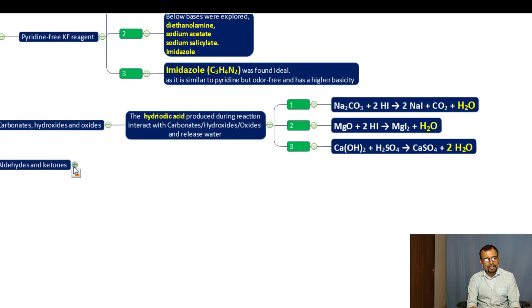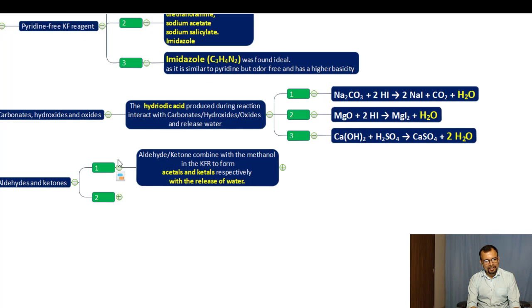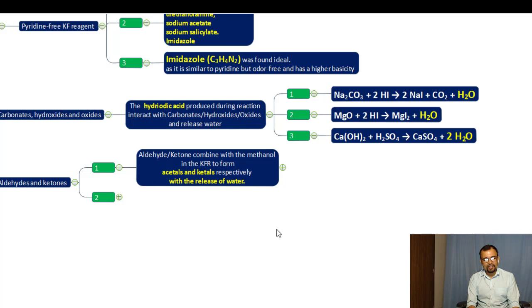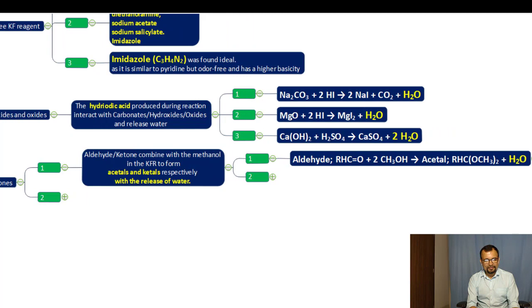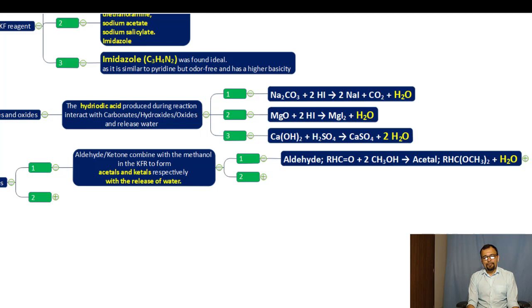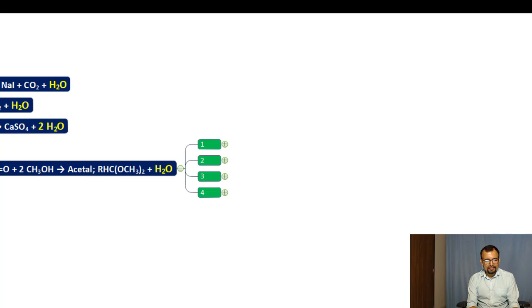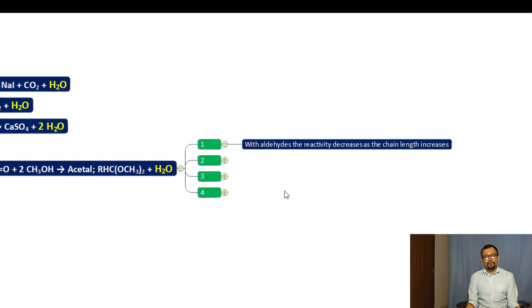The second side reaction involves aldehydes and ketones. The KF reagent is not suitable to analyze water content in aldehydes and ketones because they combine with the methanol in the KF reagent to form acetals and ketals respectively, with the release of water. The aldehydes form acetal plus water when they react with the methanol, which is present as a diluent in the KF reagent.